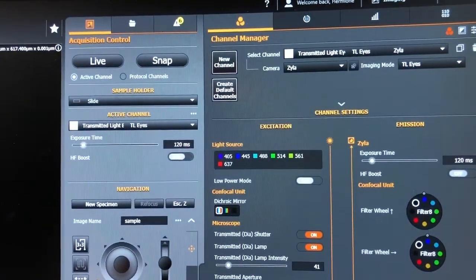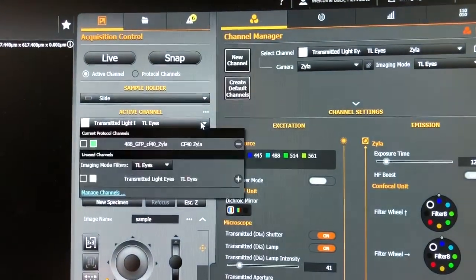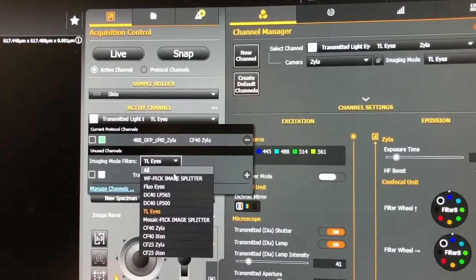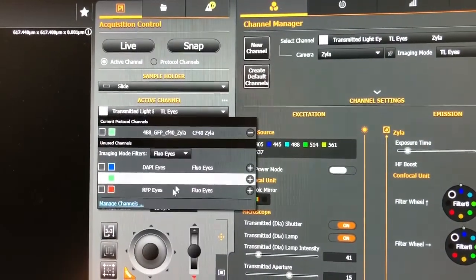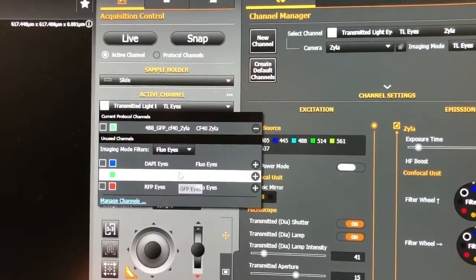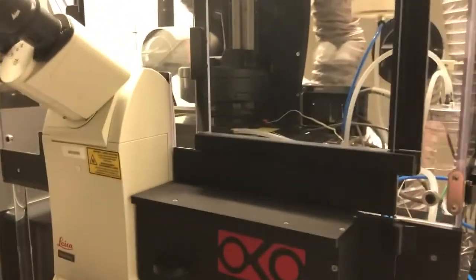If instead of transmitted light we want to find our sample with fluorescence light, we're going to select as our active channel in the imaging mode whichever of these three fluorescence filters we want. For example, if you want GFP, we're going to press this one and at that point we can come over here.